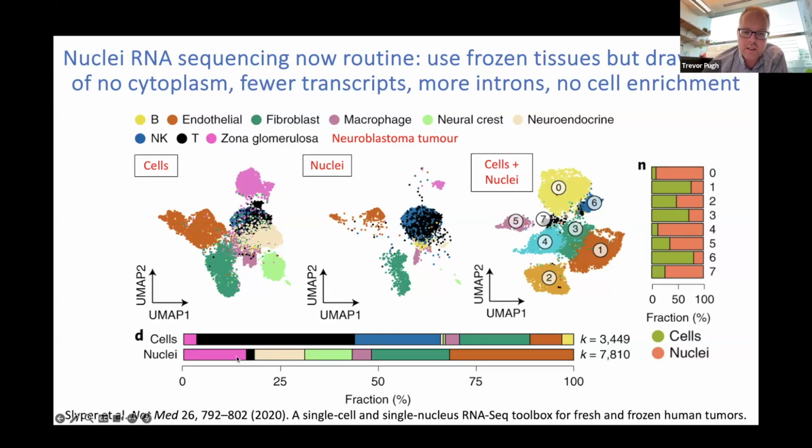This really jumps out in the stacked bar plot down here at the bottom, really showing that there is cellular bias across these two. So if you're really interested in natural killer cells, you may not want to use one of these approaches versus another, because some of these cells are dying when they're frozen, but may be intact if you fix them and are studying the nuclei. So this is another important design decision that you as an analyst really need to know about, especially if your study combines fresh samples or a sample set based on nuclei. It's going to be very challenging to integrate and put these two sample types together.